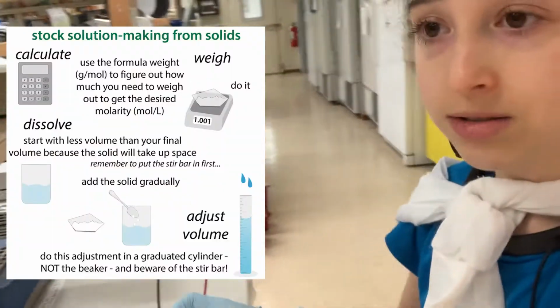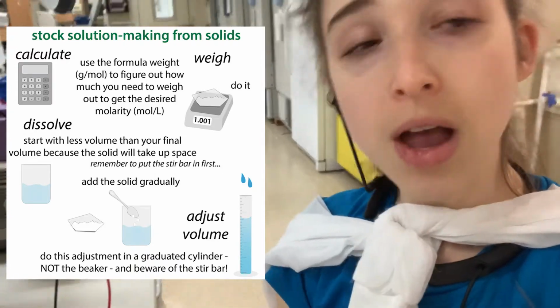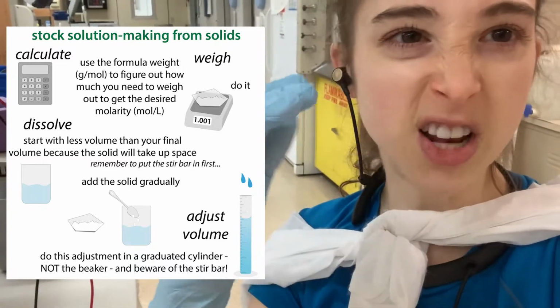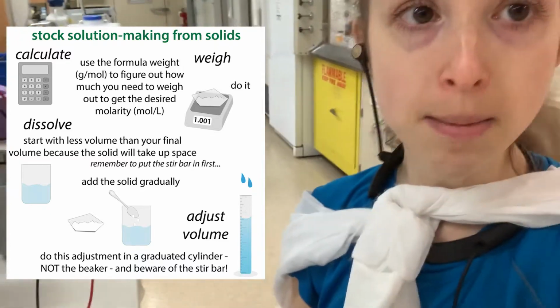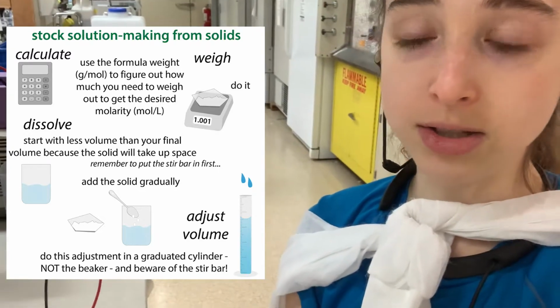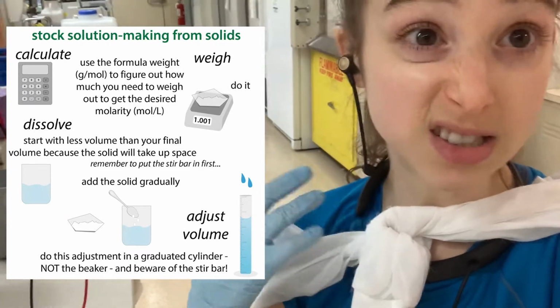And then you weigh it out. And then, if I want to make 1 liter, I'll take a 1 liter beaker. I'll fill it up to about 750 mils, and then I'll start pouring in the solid, slowly, depending on how fast something dissolves.